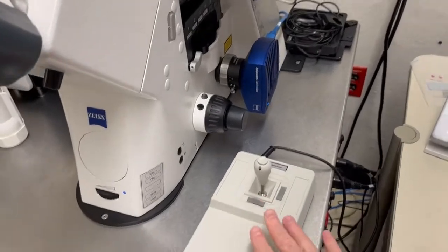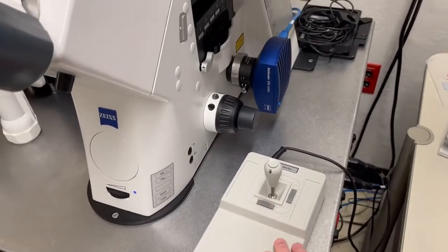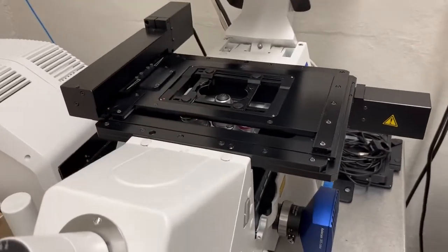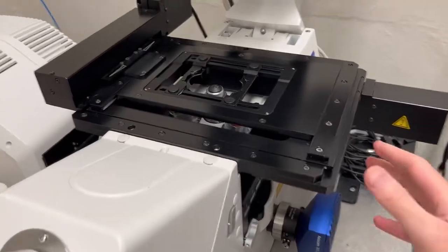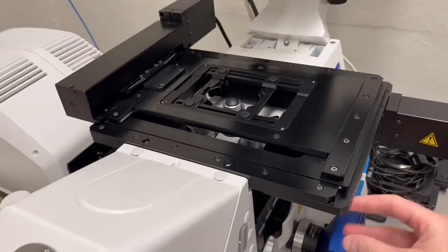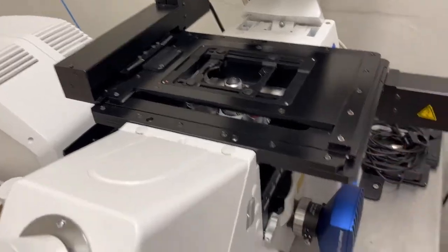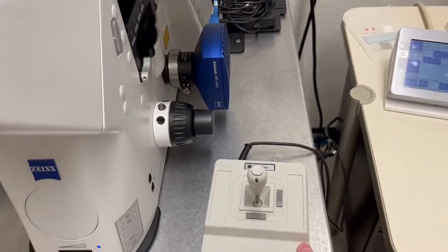You will notice that there is a joystick next to the microscope. That's because the stage on this confocal is motorized, so there's no way of moving something here to move the stage. You have to use the joystick.